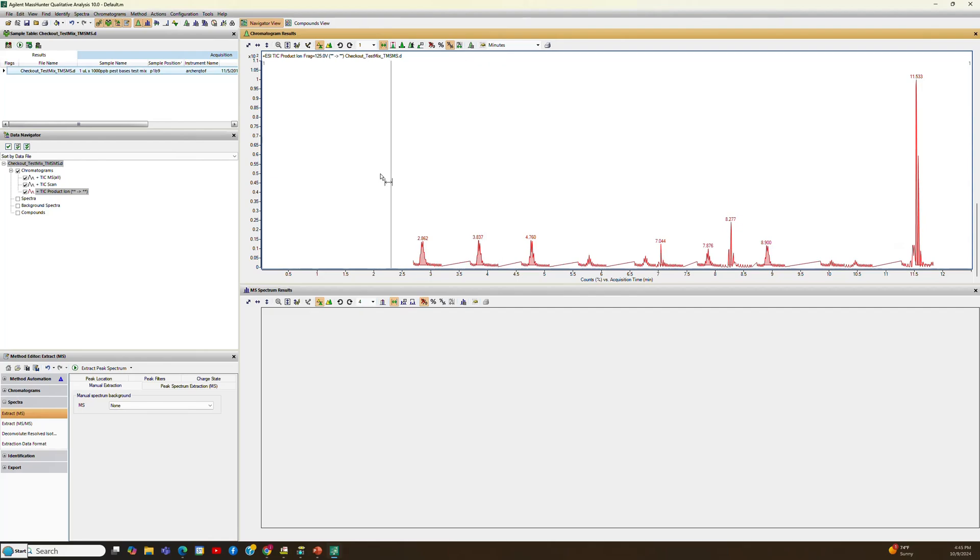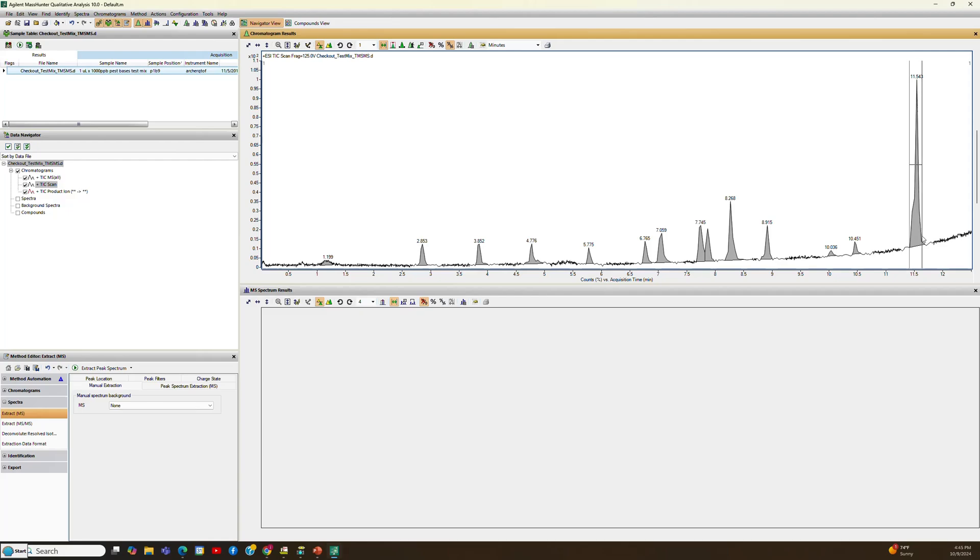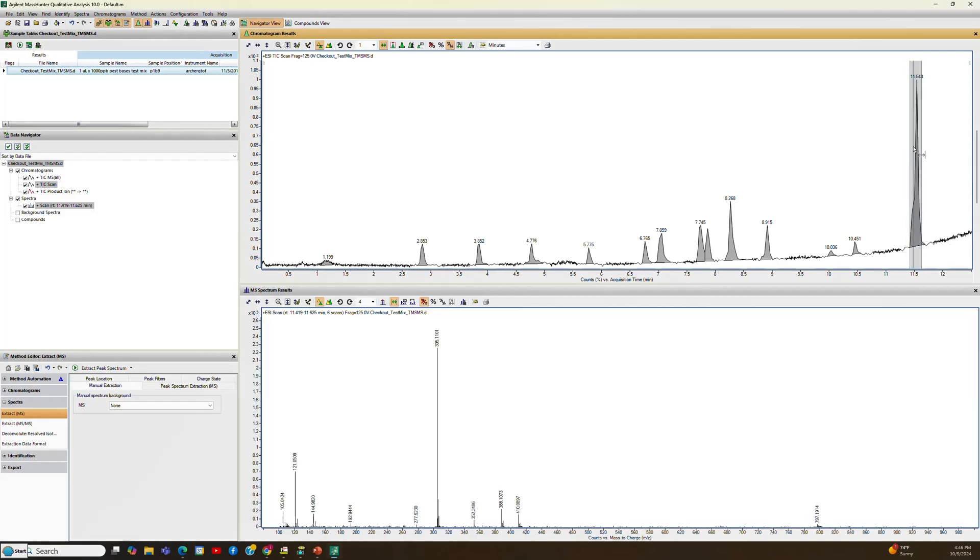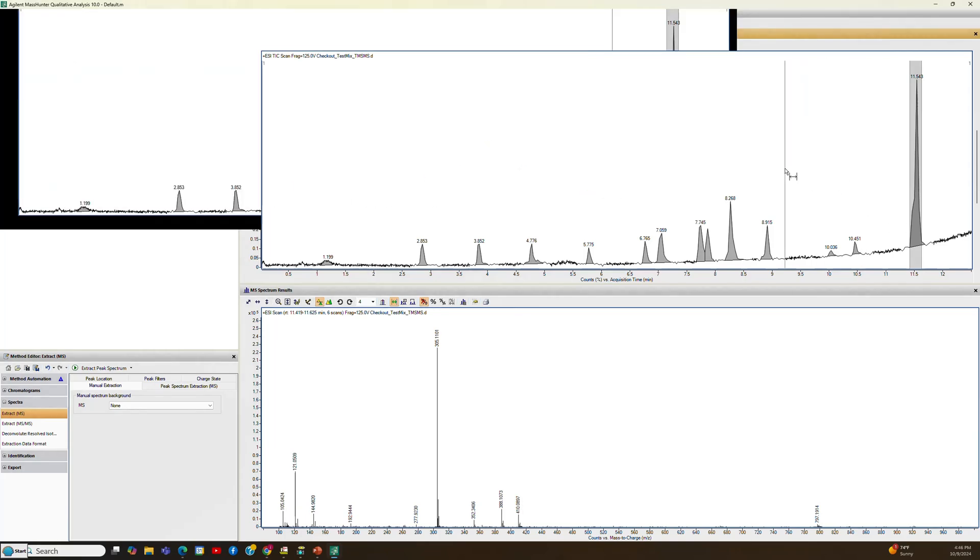So if we want to do a search, you can get the MS spectrum if you want to see what it looks like. I just select it, and then I double left-click on it, and you'll see that 305.1101, this is an MH-plus adduct for this species.